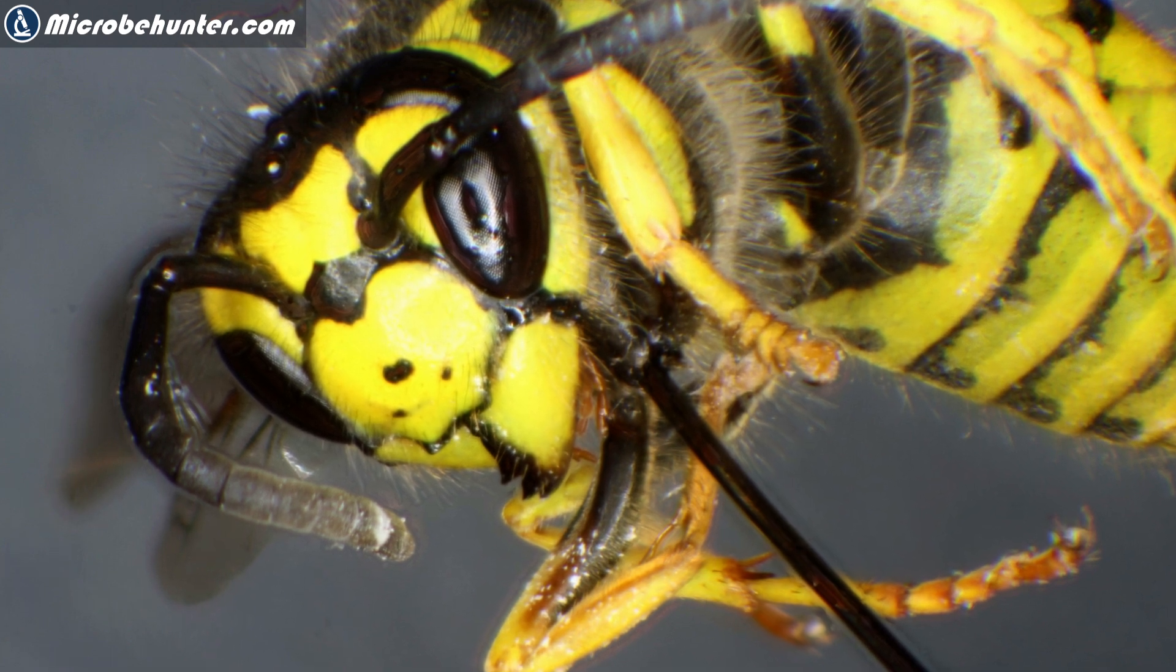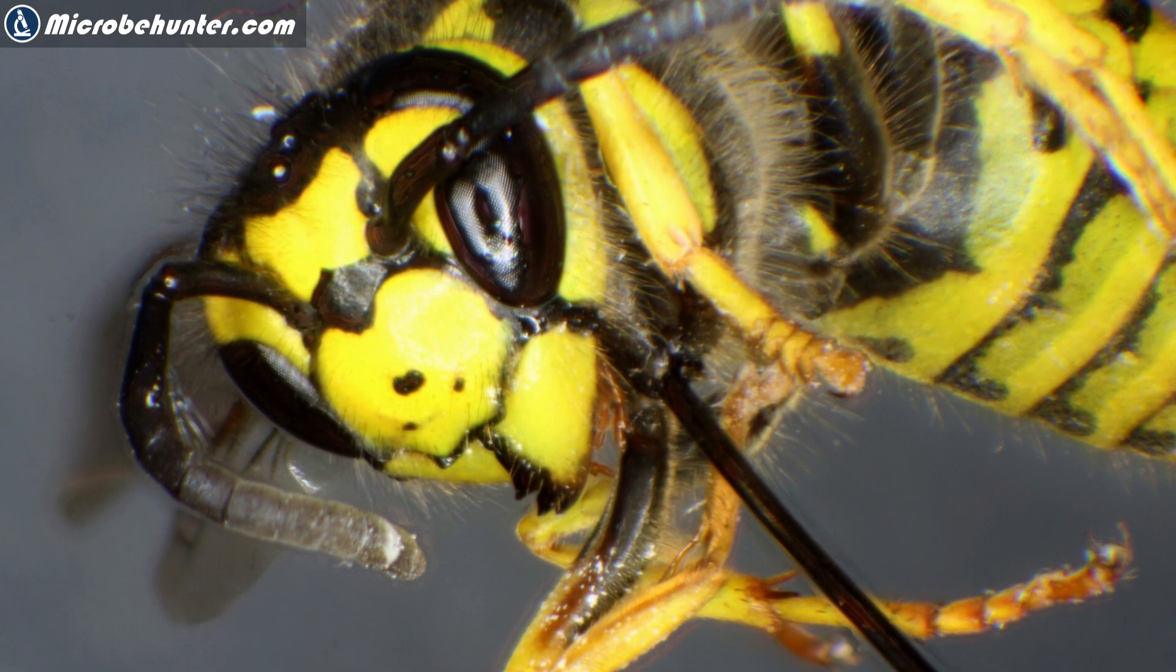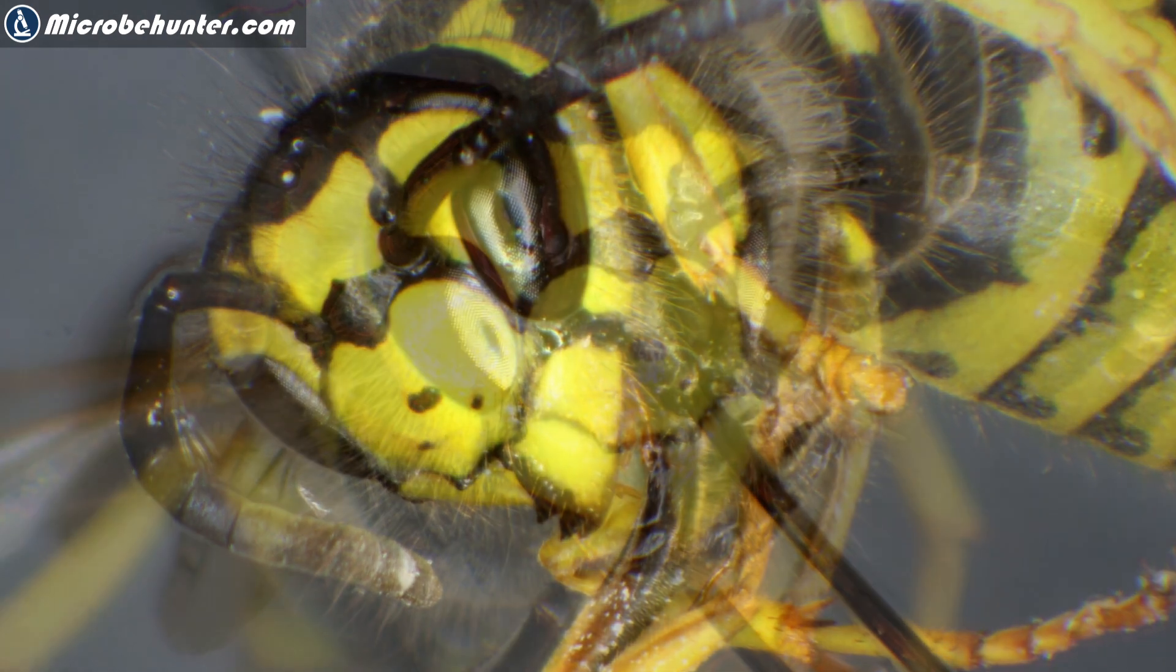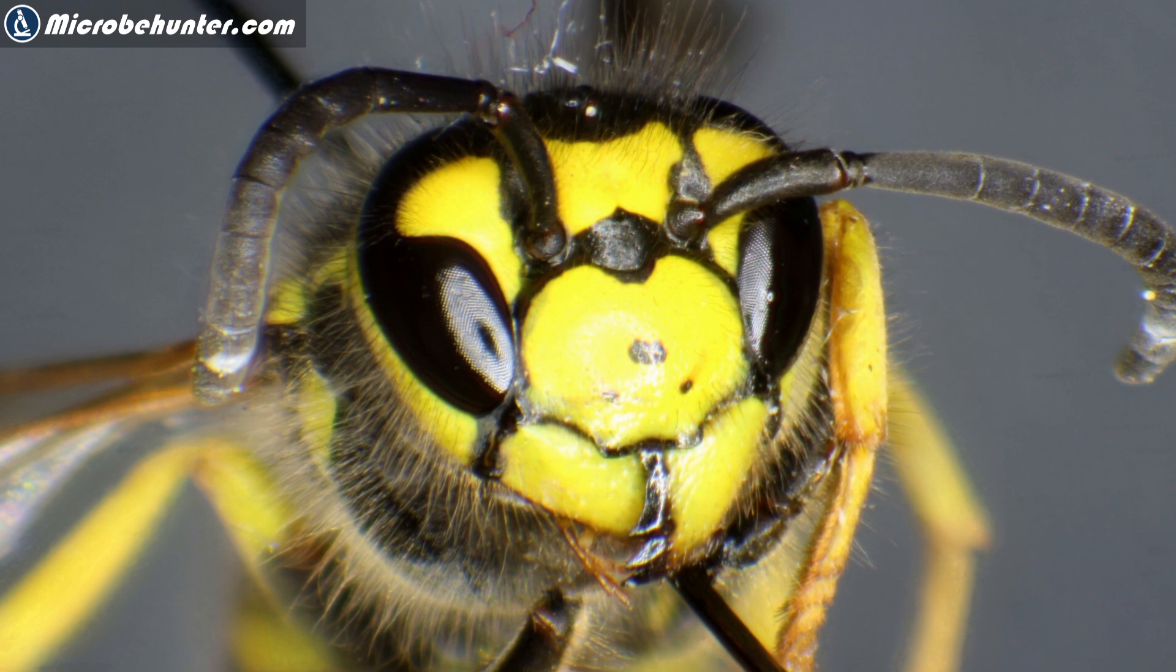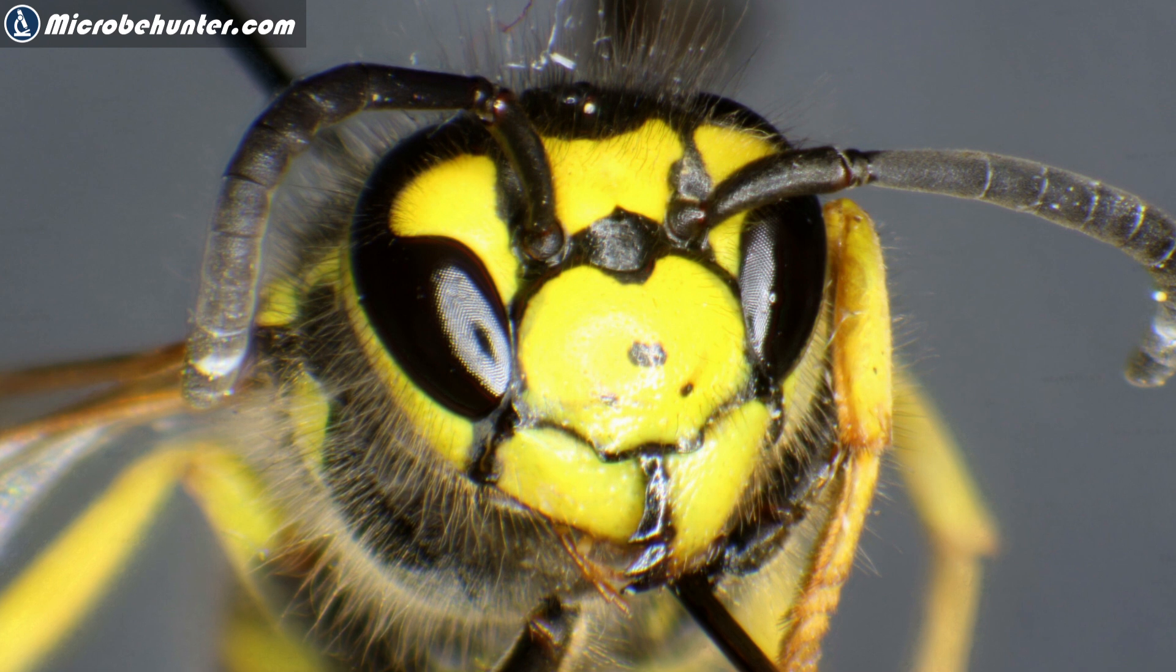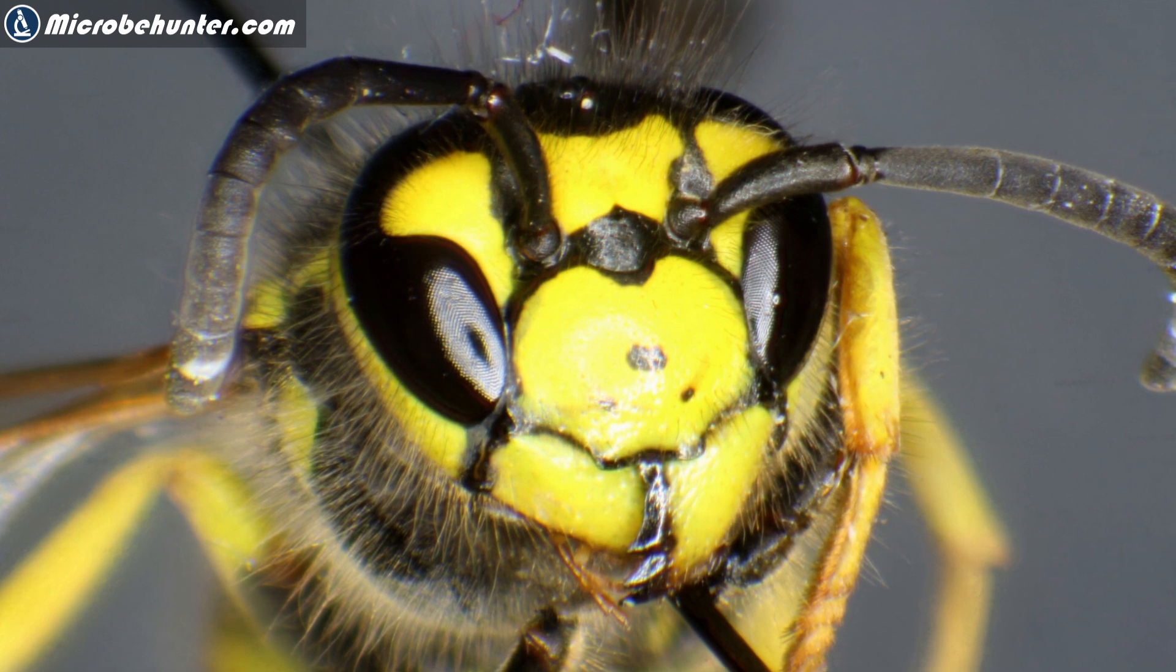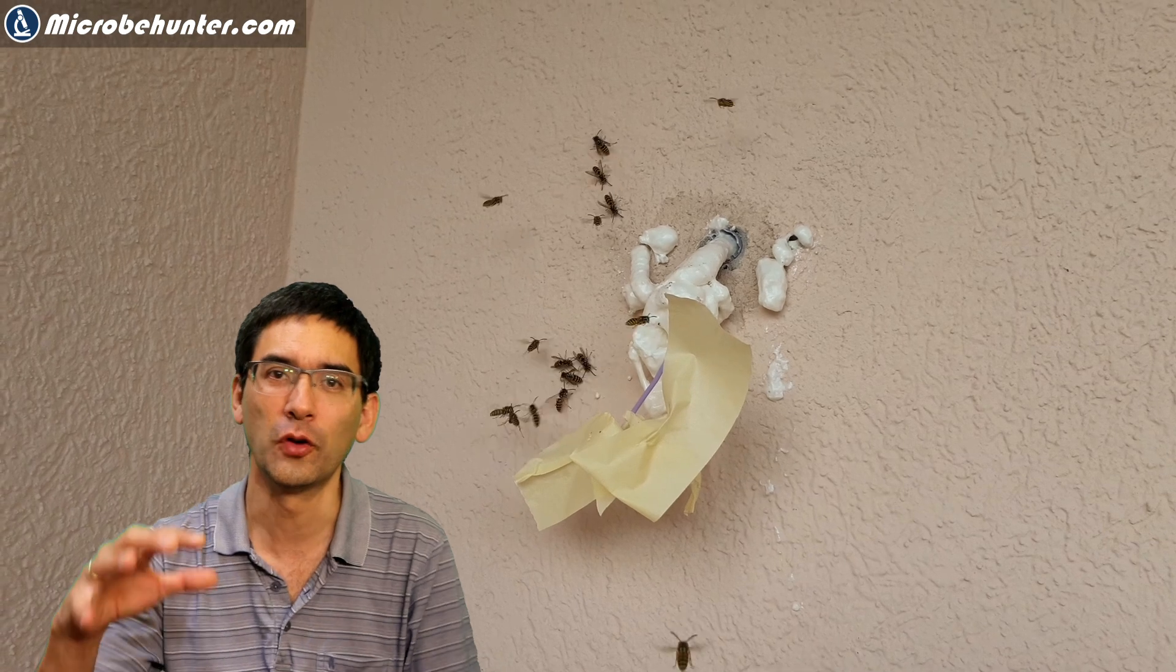And what I then have done is I tried to make a stacked image. And this means that I took many pictures at different focus levels. And then I tried to combine it together into one final image that is in focus all the way through. So that's what you see here. I think it looks quite nice. And I also made a second one from a different angle. And this also worked quite well. So what you have to do is you always have to change the focus in a very organized way. And then the software will combine it.